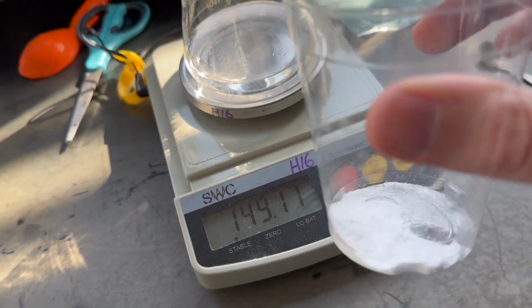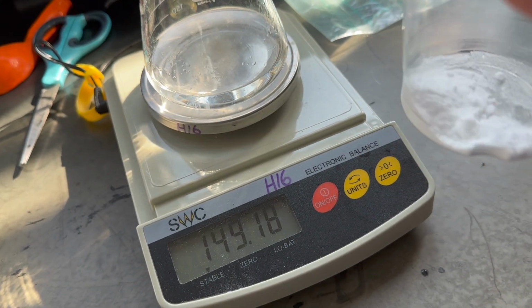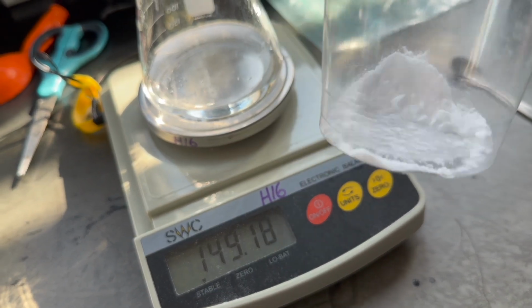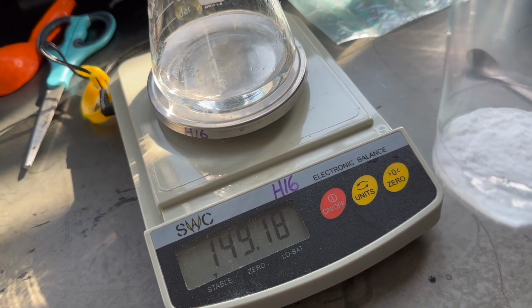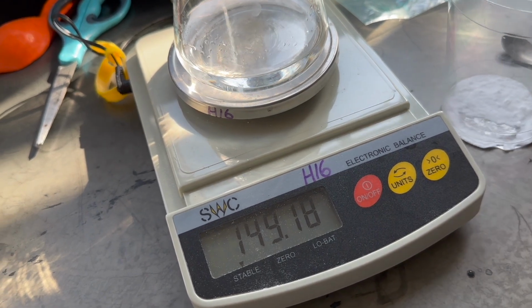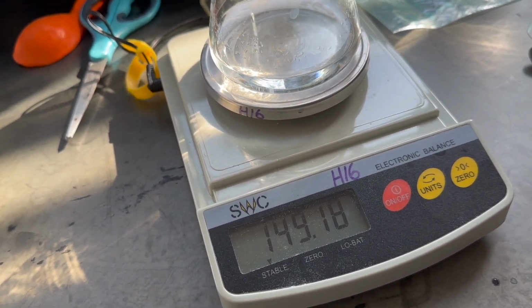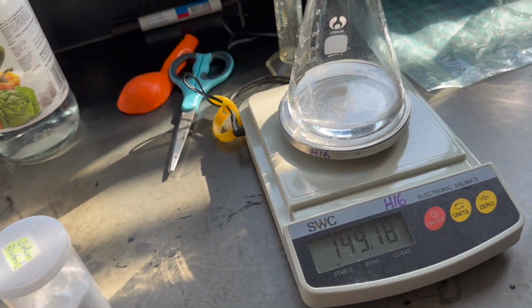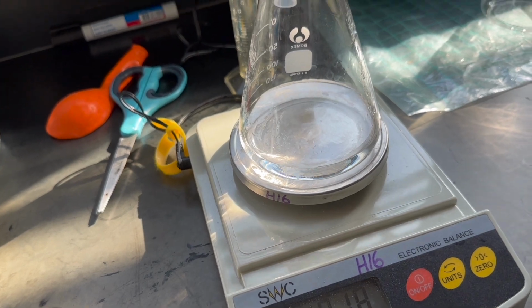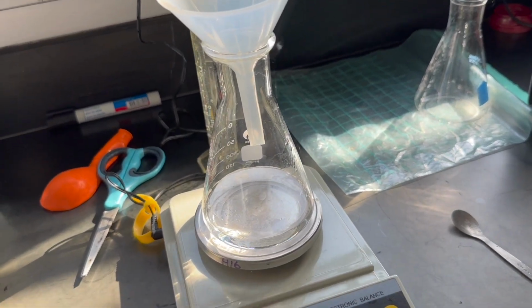You'll notice as I put the baking soda in, the number will go up to account for the mass of the baking soda, but then if you watch it closely, it will actually start to drop. So as you watch that, you can think about why is that mass decreasing. Let me get my funnel just so I don't spill any. And here we go.